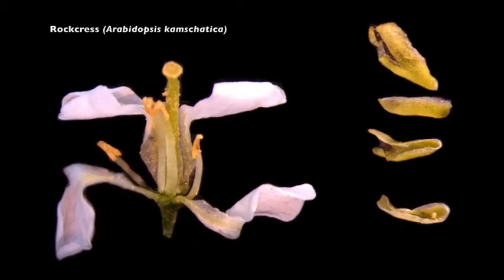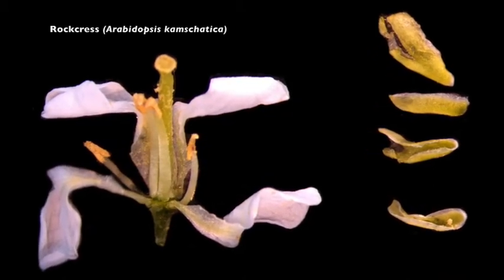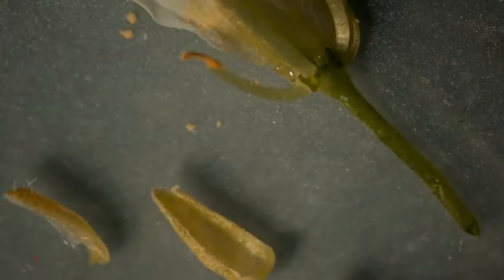Here we see the lyre-leafed rock crest with the four sepals removed. Once the sepals are removed, we continue by removing the four white petals. Note that the petals are clawed — you can see this in the upper right-hand corner. The petals are narrowing towards the base, so it's called a claw. Here I'm removing the six stamens: there are four long stamens and two short stamens. The two shorter ones are inserted at a lower whorl, and then the four longer stamens are inserted in a subsequent whorl.